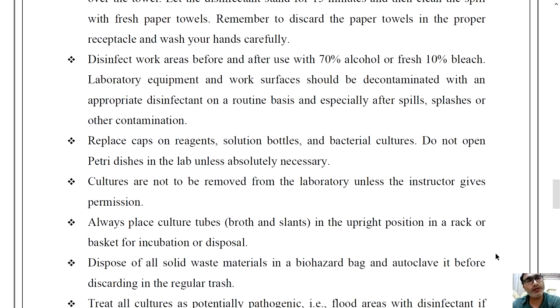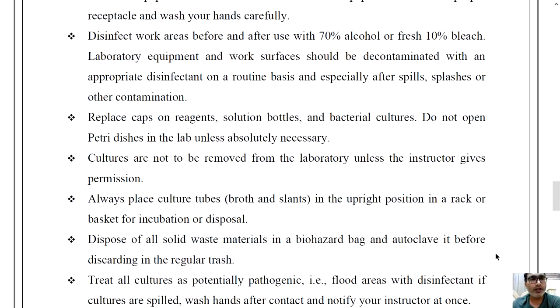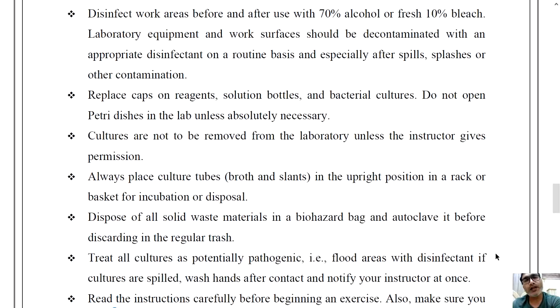Discard used materials to a proper container. Disinfect work areas before and after use with 70% alcohol or fresh 10% bleach — these are the most recommended disinfectants for cleaning the working table. Laboratory equipment and work surfaces should be disinfected with an appropriate disinfectant on a routine basis, and especially after spills, splashes, or other contamination.